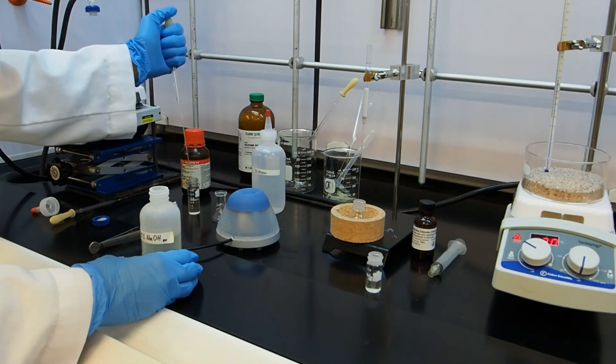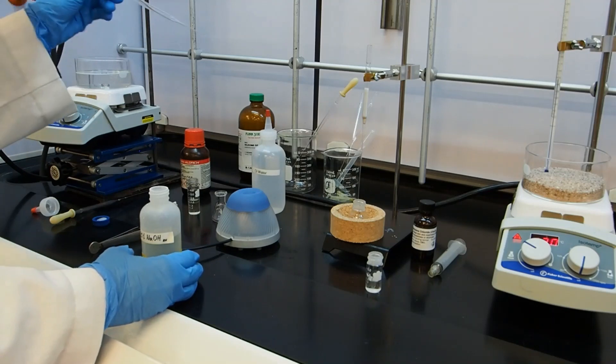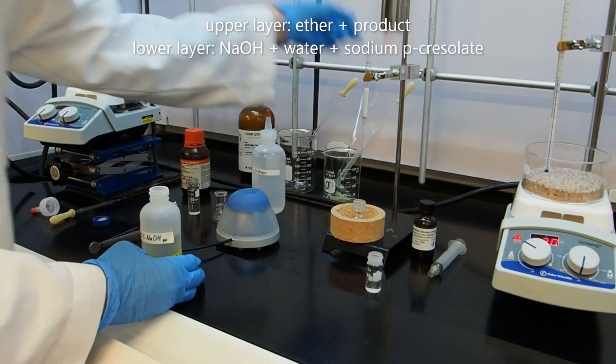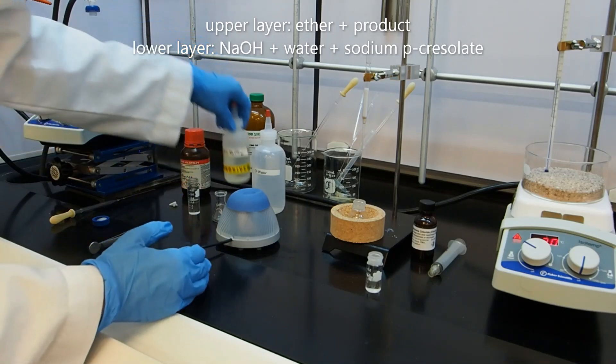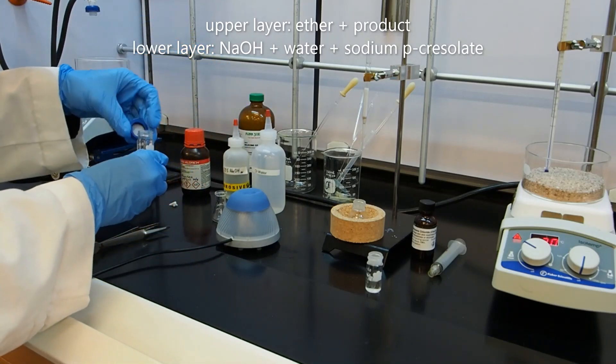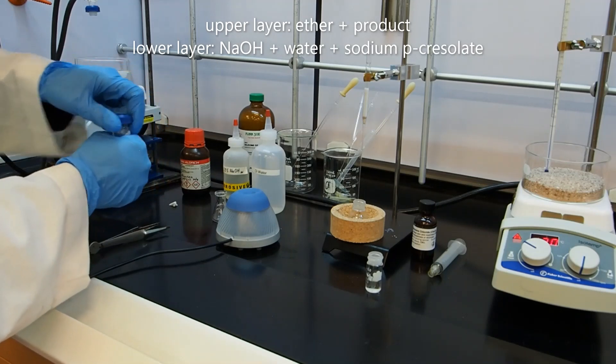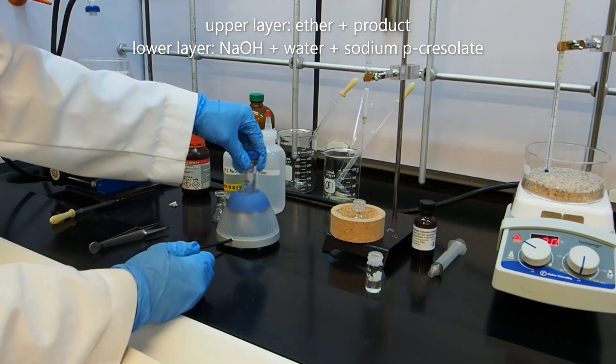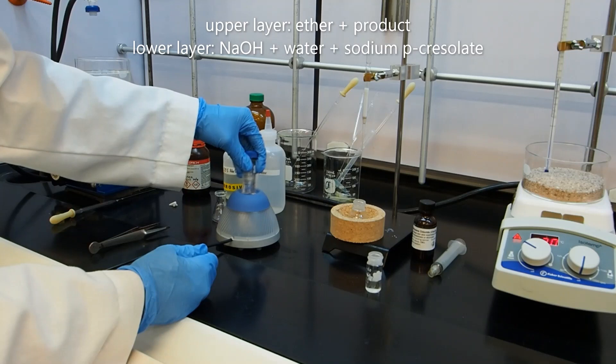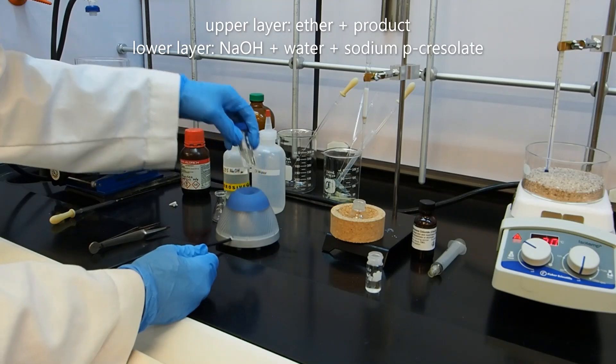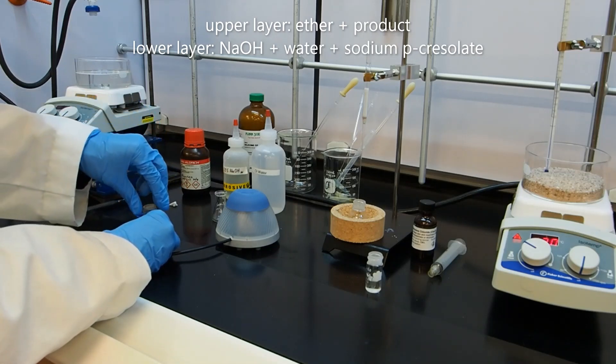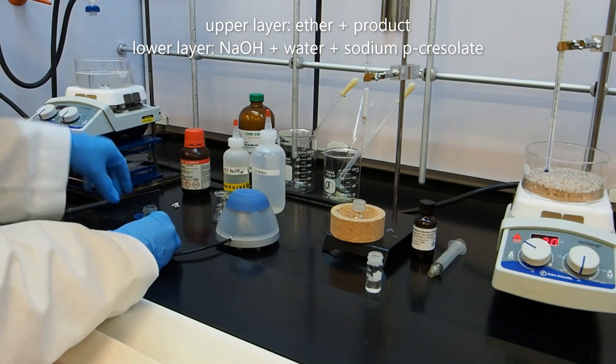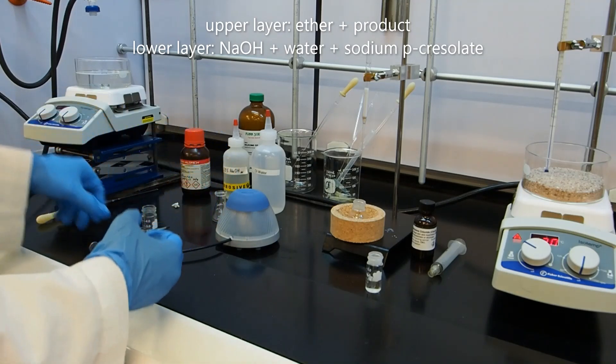The point of this is to remove any unreacted paracresol. It is acidic because it's a phenol and the sodium hydroxide will pull off that acidic proton and make it an ion, which will then be soluble in water. So I've capped my vial. I'm going to mix the layers really well again. So this is part of isolation of the product. We're hoping that when we're done with this extraction procedure, the only thing left in the ether will be our pure product. And honestly, from the TLC, I didn't see that much paracresol left in the reaction, but we want to be sure.